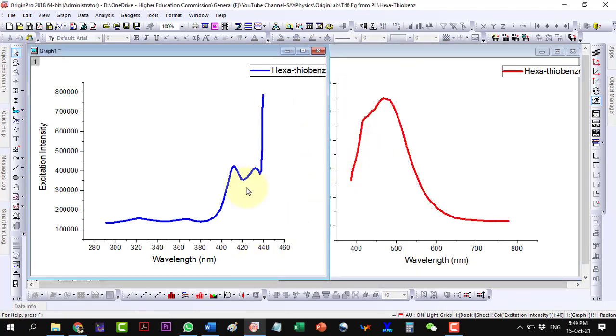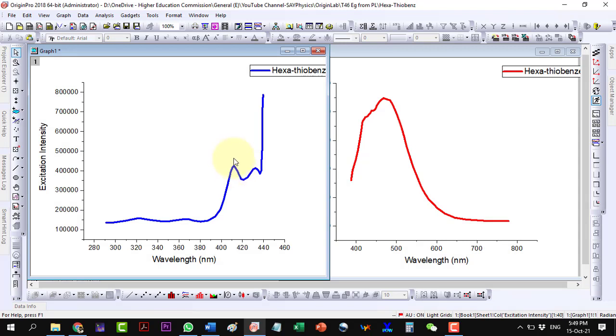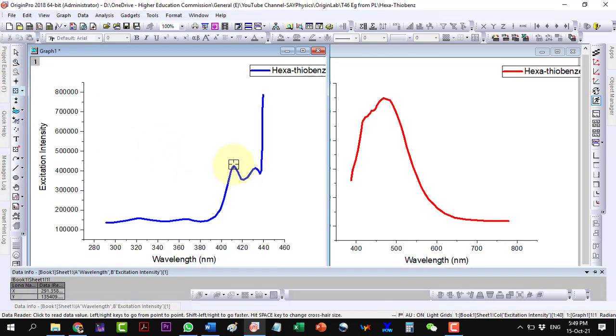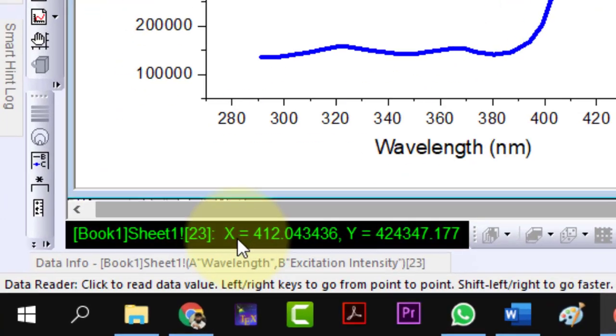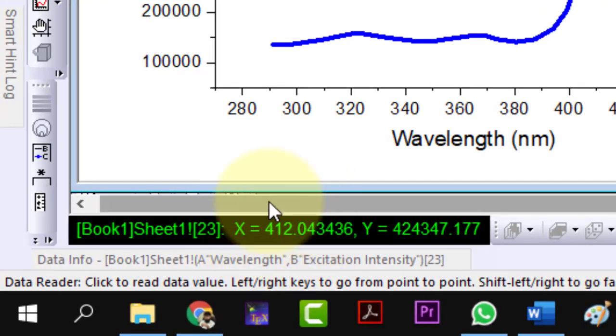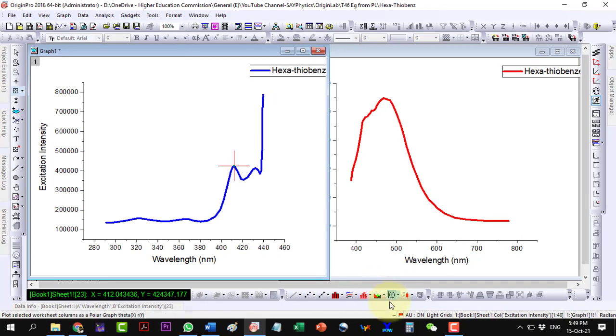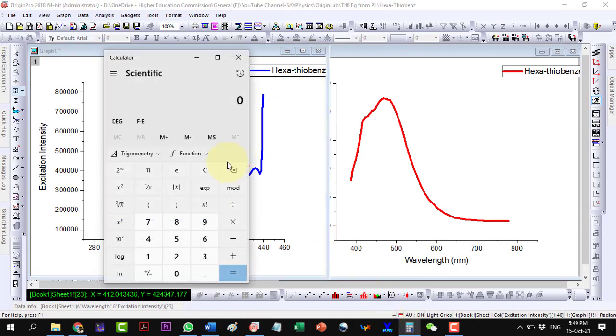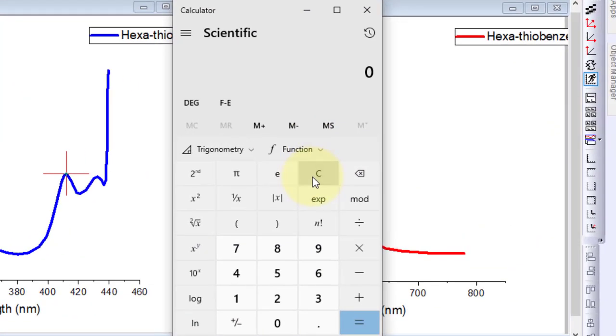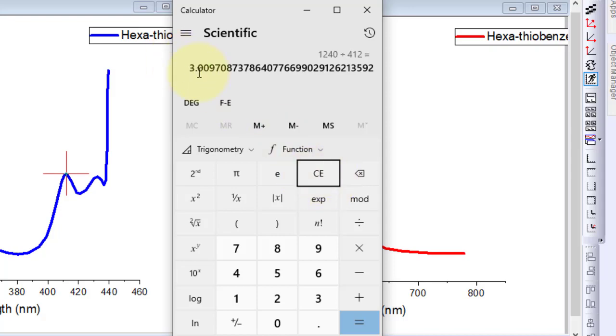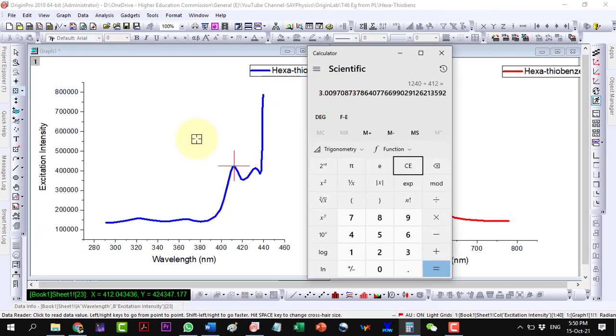In the excitation spectrum, the first peak gives the band edge value. However, we will not extrapolate it like the UV-Vis data, as the PL mechanism is somehow different from the UV absorption. We will consider the maximum value in the first peak. This value comes out to be 412 nanometers. To get the value of bandgap energy in electron volts, we will convert this value by using the relation 1240 by lambda, which we have already discussed in the above mentioned video.